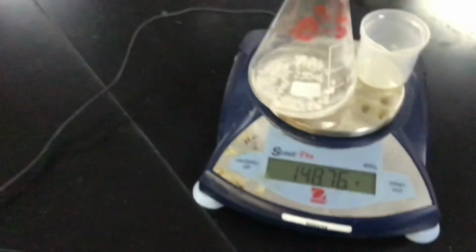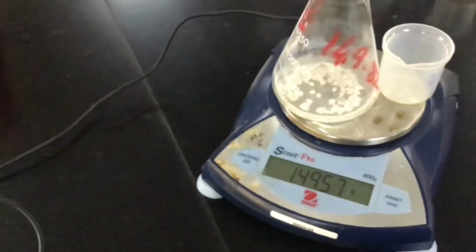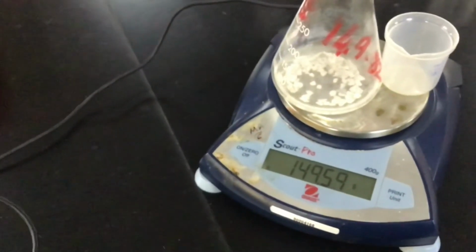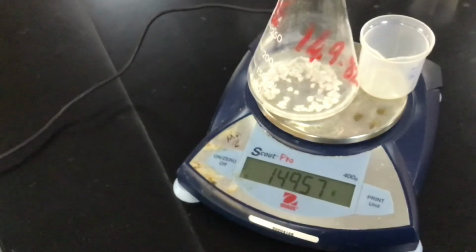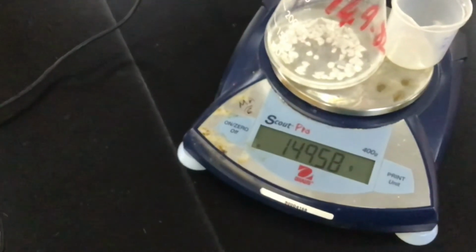Put it back on our scales. That was 149.82. It's now 149.57. So let's do a quick calculation to find out how much it's gone down by.